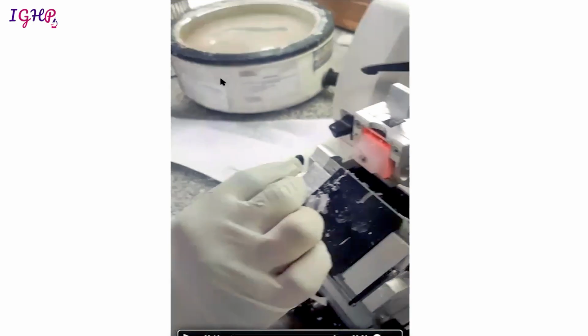And then in addition to these, you will also get many folds on your section. So these are the folds that could arise from a blunt blade, and these are the folds that could also arise if your block is not kept on the freezing part of your embedding table. So ideally, before cutting the block on the microtome, you need to freeze it so that the section becomes very clear and there are no folds on the section.